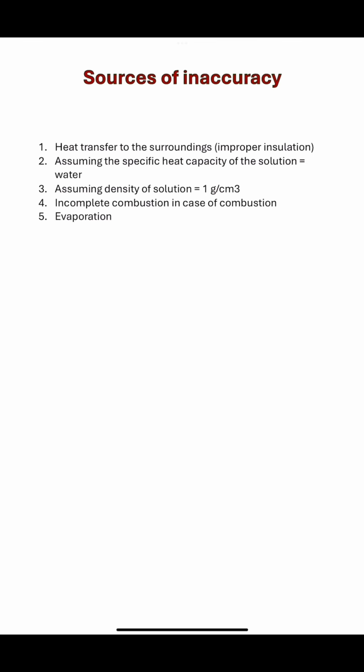First of all, the heat transfer to the surroundings due to improper insulation, and this would make the reaction less exothermic or less endothermic than it should be. And assuming that the specific heat capacity of the solution equals the specific heat capacity of water. So if you are doing a reaction with different reactants, the specific heat capacity of the solution is going to be different, but we are assuming it is exactly the same as water.